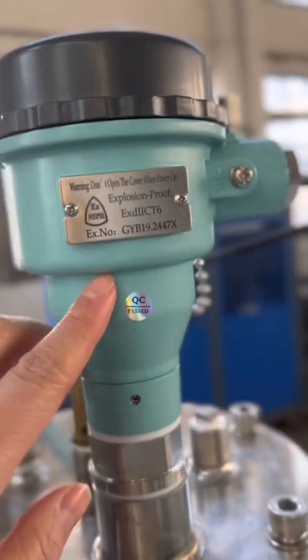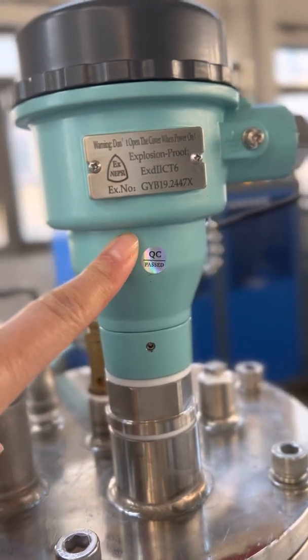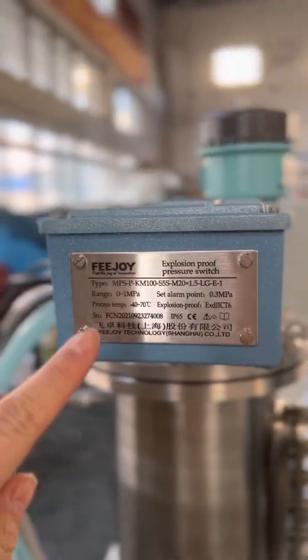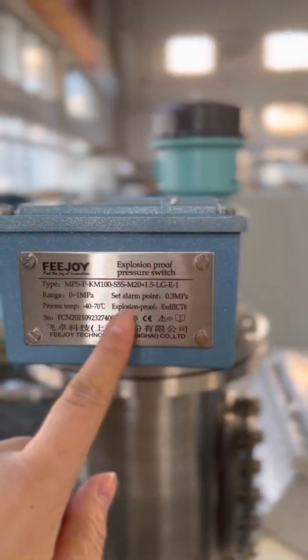This one is the sensor for the liquid level of cooling liquid, explosion-proof. And this blue one is the sensor for the pressure, explosion-proof.